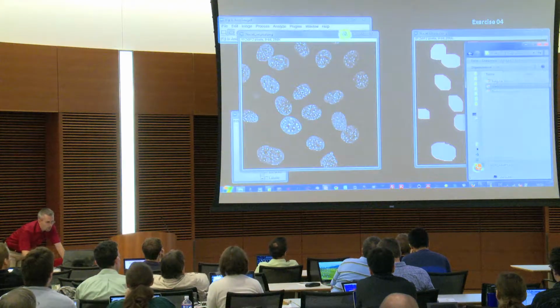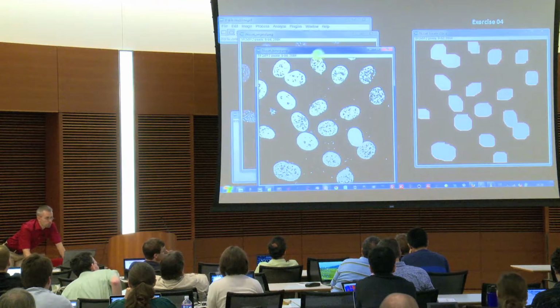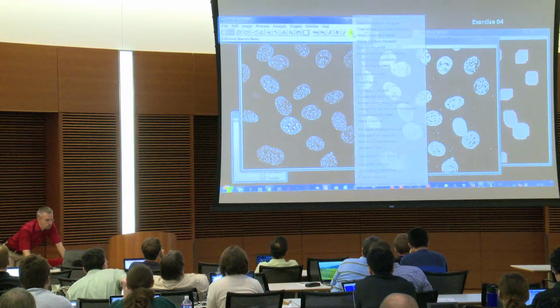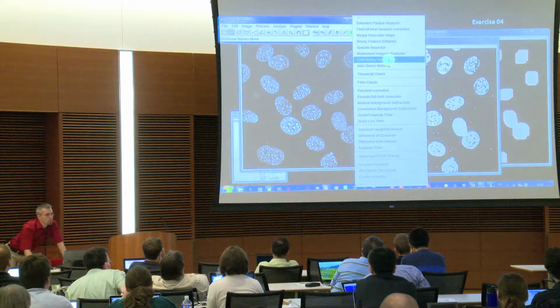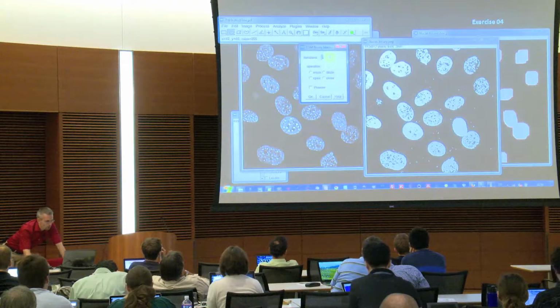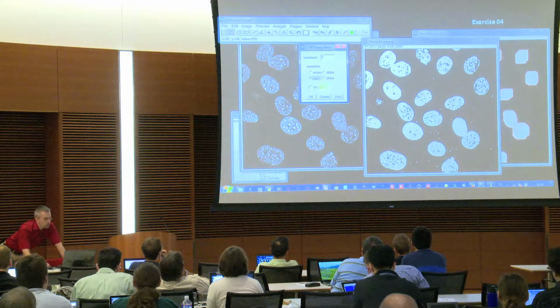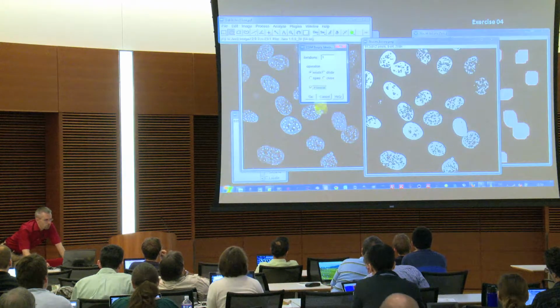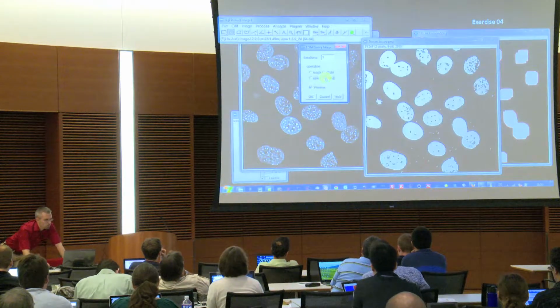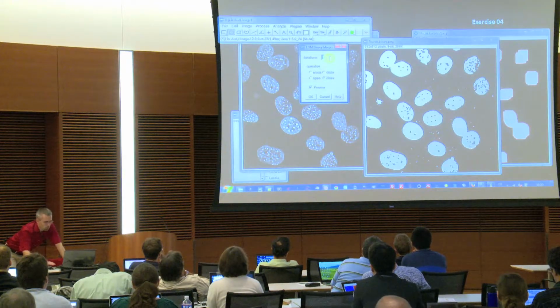So if I take the binary image again, and now you do the same functions, but do it with the toolbox. So I'll take that image, go to the toolbox, and use now the EDM-based binary operations. What we first did was we did an opening. We can also click our way through those ones. If I go to preview, you see erode, dilate, open, close. First we did the closing. So we did it 5 times.